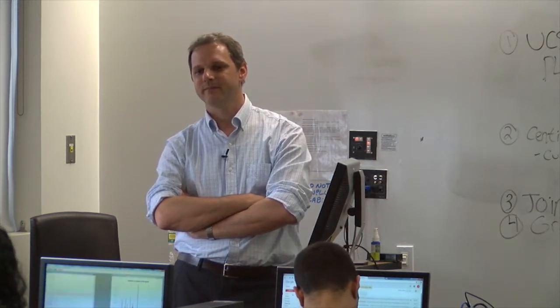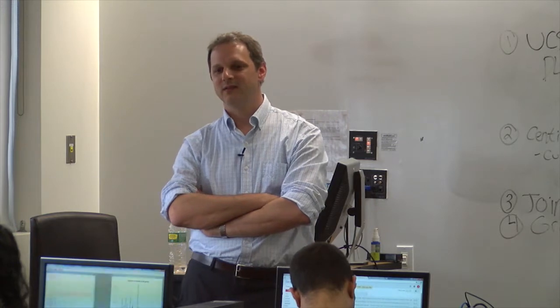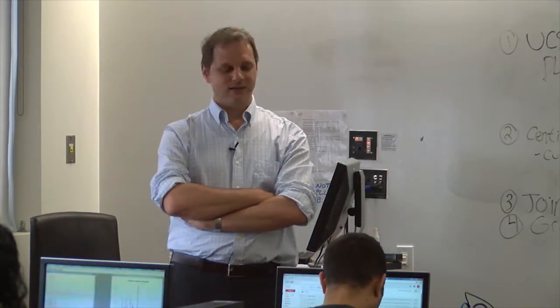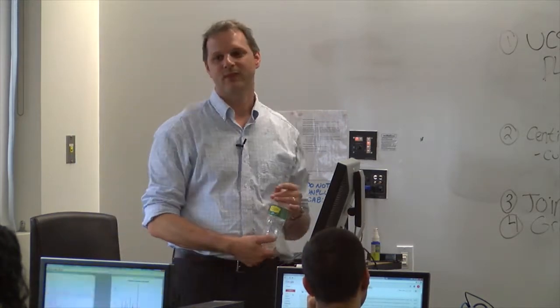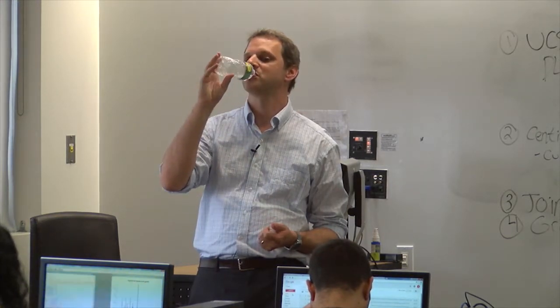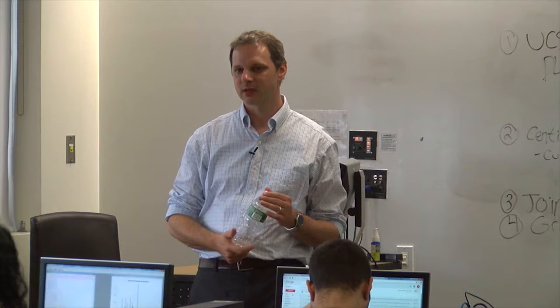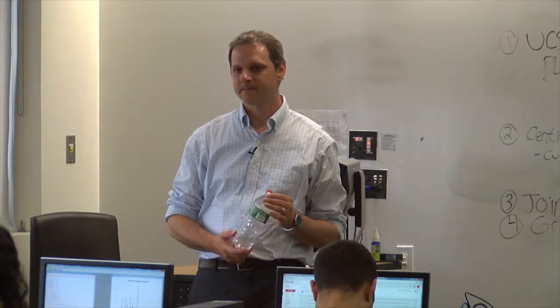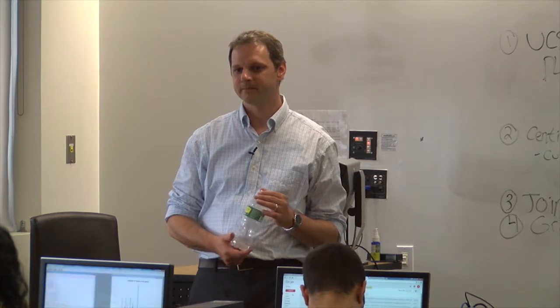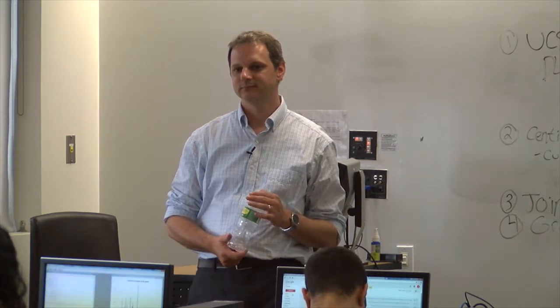Yeah. So let me rephrase the question. The Pritchard lab has a lot less binding sites than the ChIP-seq data. In fact, on some things, there's a ChIP-seq signal that's incredibly strong that's not found at all in the Pritchard data. So, the CENTIPEDE data set is based on lymphoblastoid cell lines, so it's one cell type. If you're thinking about it in cell lines with the context, then you may have it the other way around. You're not going to be able to pull down a region because of regulation. In this situation, you actually are able to pull down regions and have very strong peaks in certain regions that are not predicted by the Pritchard algorithm. The question is, how do you navigate that?